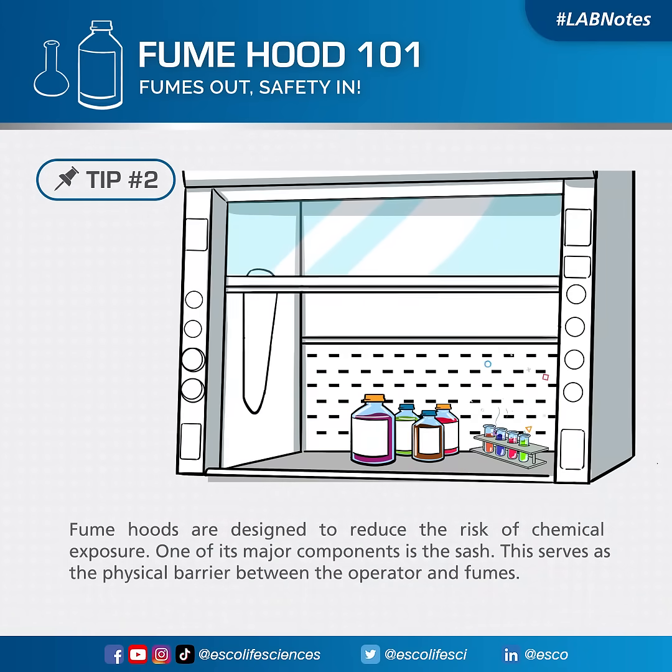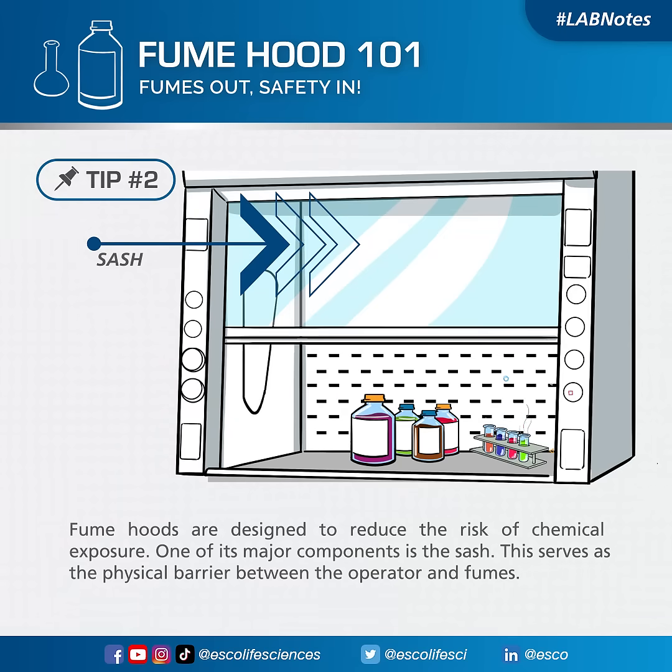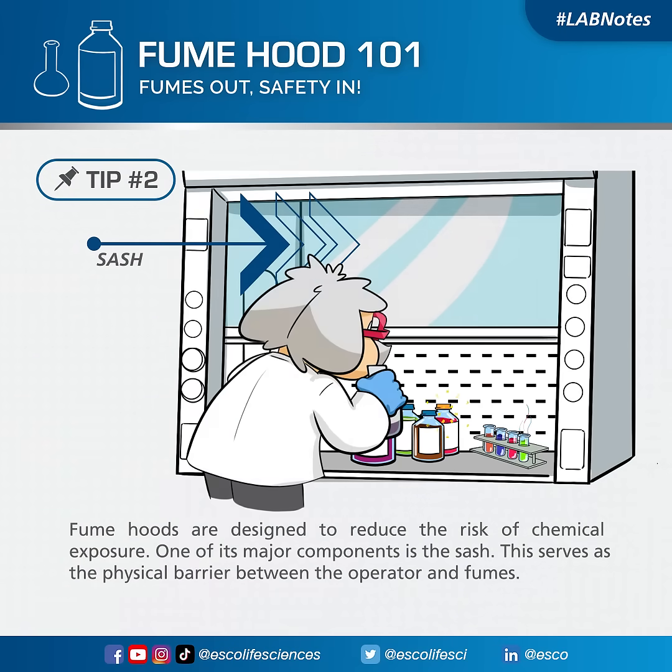Fumehoods are designed to reduce the risk of chemical exposure. One of its major components is the sash. This serves as the physical barrier between the operator and fumes.